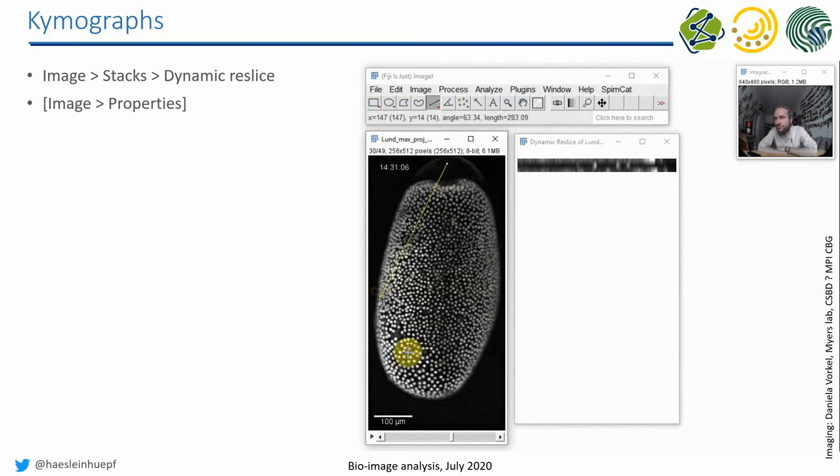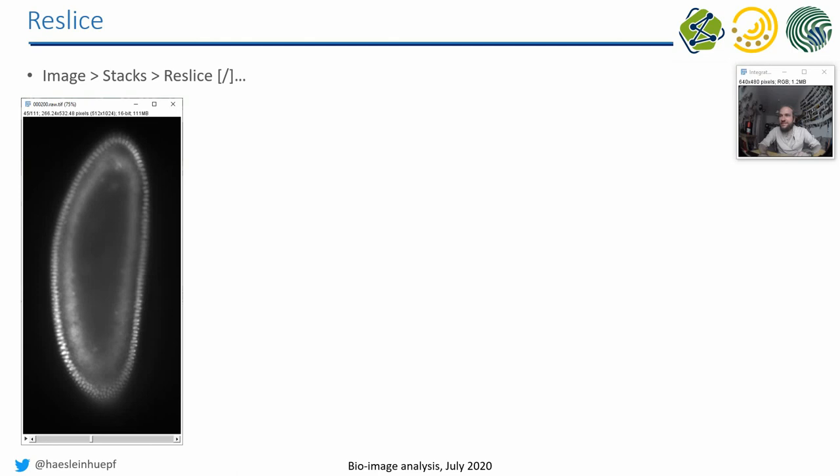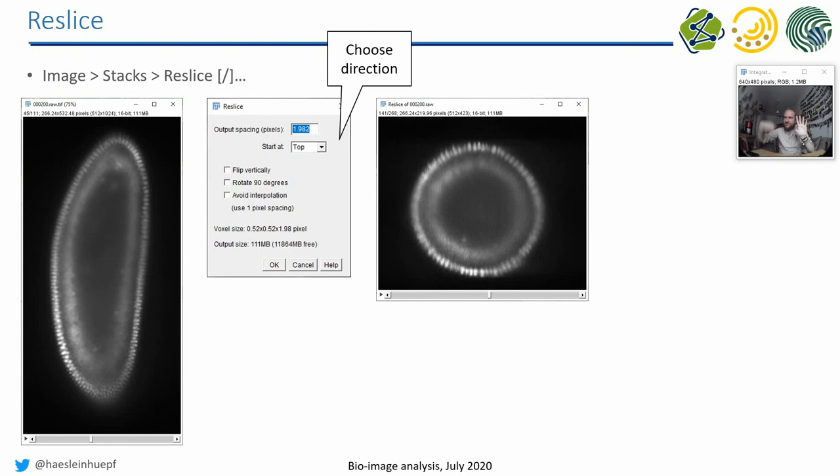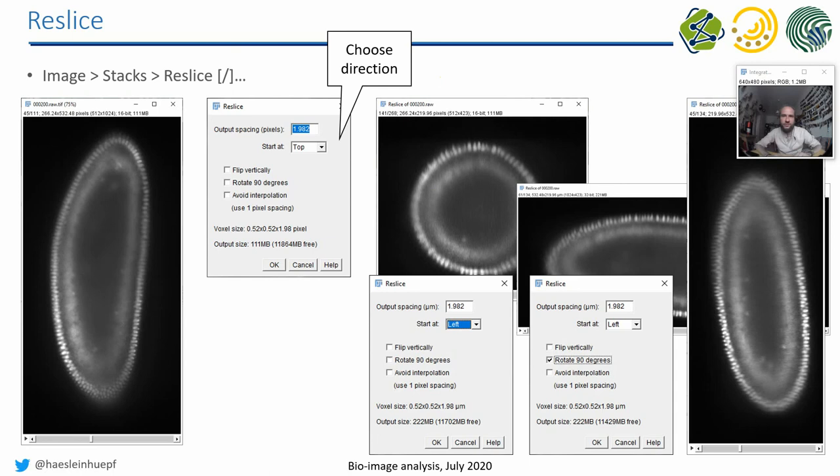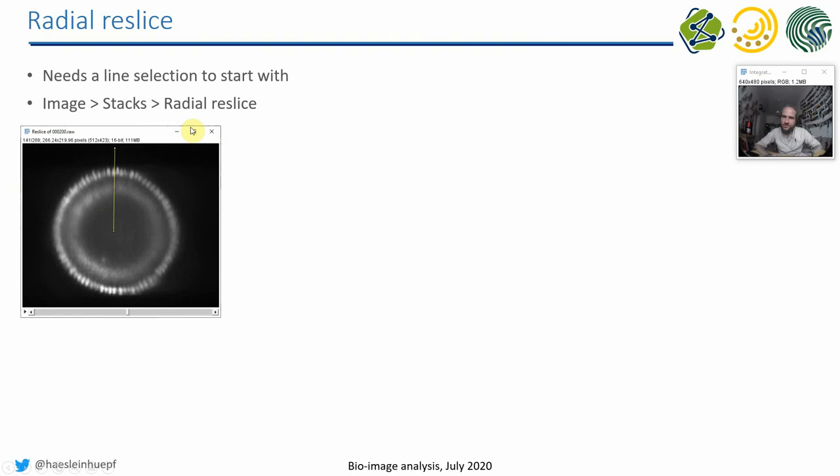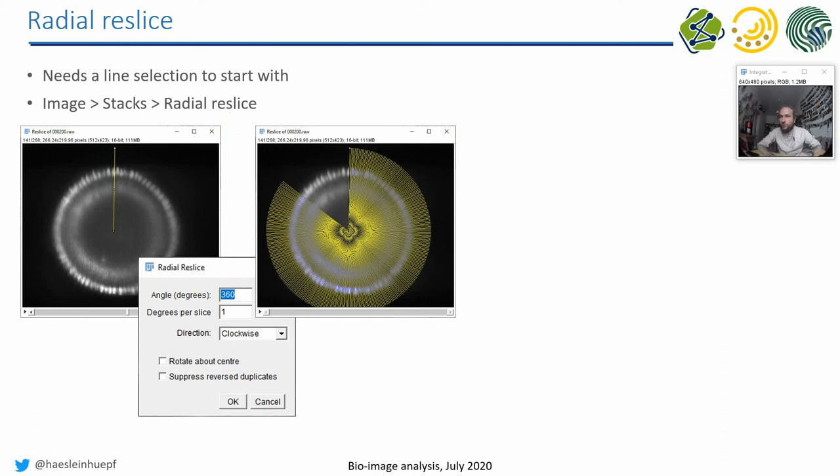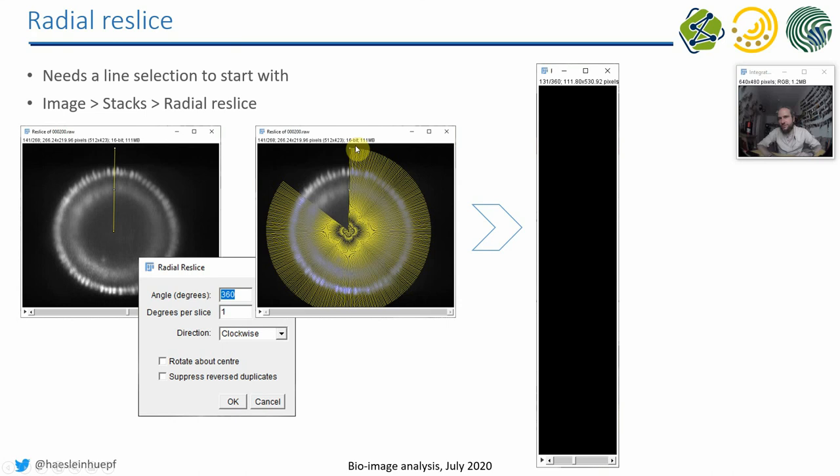This is basically a recap of last week. Reslicing. We start from our embryo, we see it in this particular plane, and we are now reslicing it from the top to see this embryo in a circle shape from plane to plane. We will assume that this is a cylinder, that the embryo has the shape of a cylinder. You can do this from different perspectives. By drawing a line here, you can ask ImageJ to rotate this line around the embryo and take individual new images out. You start the ImageStacksRadial reslice tool. You see what it is doing because it will draw these lines in the order how it is processing the dataset. Then you get a new stack out, where these two-dimensional images correspond to the pixel intensities along this line and in Z.